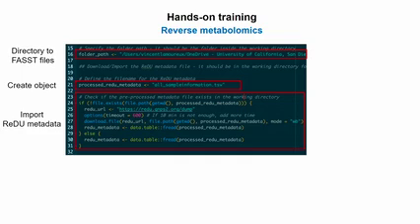So how many of you got the 3 files loaded automatically? Not a lot yet. I guess you don't have it on. No, I don't have it, but you can get it from the GitHub also if you want. It's also not working. Okay, sorry about that.